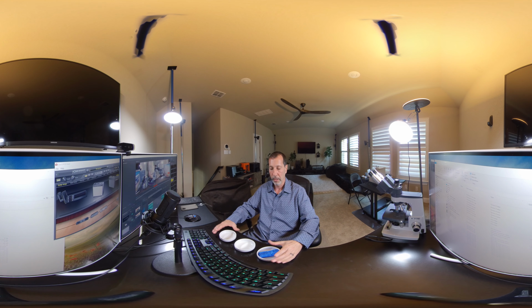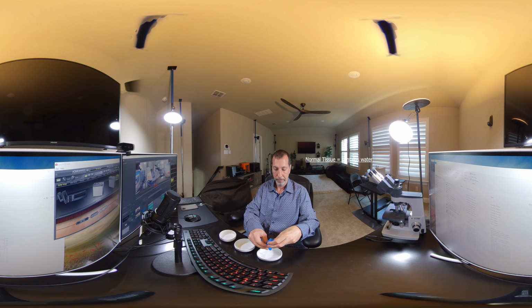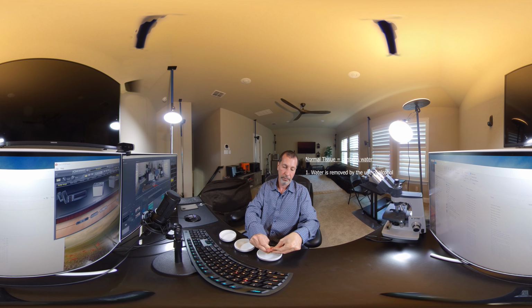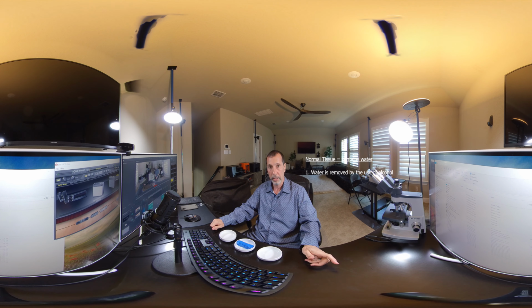So this is a representation of what steps occur in the tissue processor. And this sponge is a representation of tissue. So this is tissue. So in its natural state, tissue is full of water. And in the tissue processor, the first major step that happens overall is water is removed. And then it goes into a non-aqueous solution. In this case, it's going to be alcohol. So alcohol, 100% alcohol, is non-aqueous.